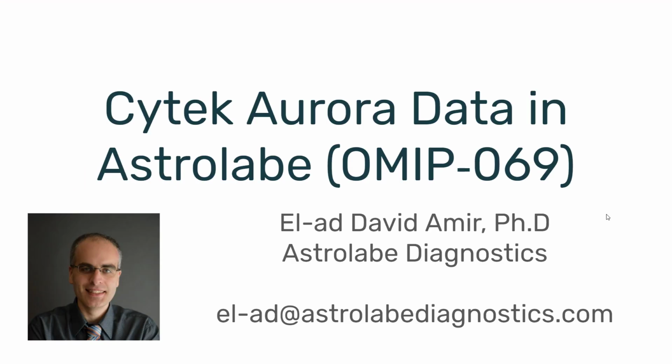Thank you for listening, and if you are planning to do any Cytek Aurora data, I encourage you to reach out and talk to us about your analysis plans. As I mentioned, it's a great instrument. It's a very exciting OMIP and panel, but be wary of the analysis, be wary of the gating, and the time investment in that regard.